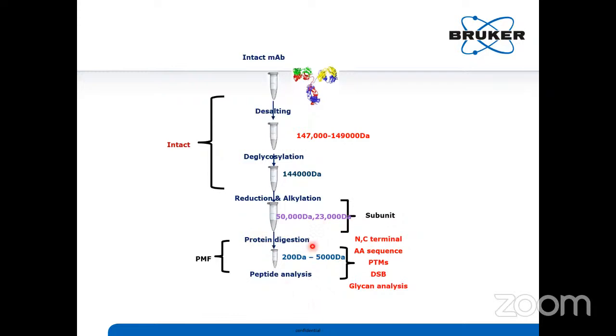Next, protein digestion, where you will add your enzyme, trypsin, chymotrypsin. As per your requirement, you will add different enzymes. You will keep it for digestion. Once you keep it for digestion, whatever protein sequence is there, it will break into peptides. By using these peptides, you can confirm N-terminal, C-terminal, amino acid sequence, any PTMs that happen, you can check disulfide bonding, and you can do glycan analysis.